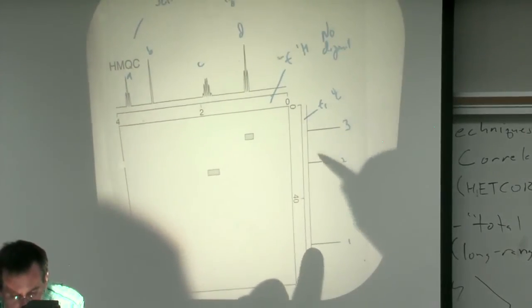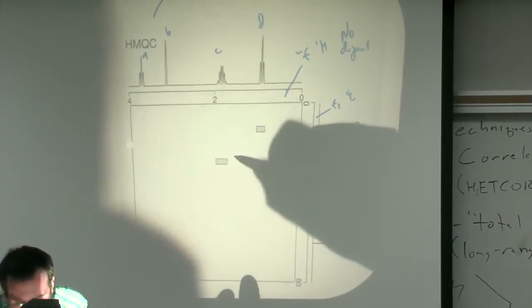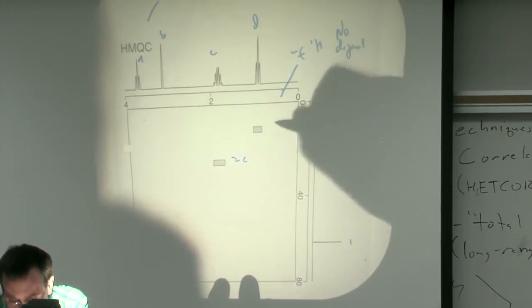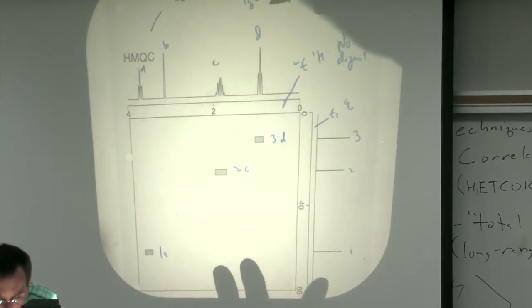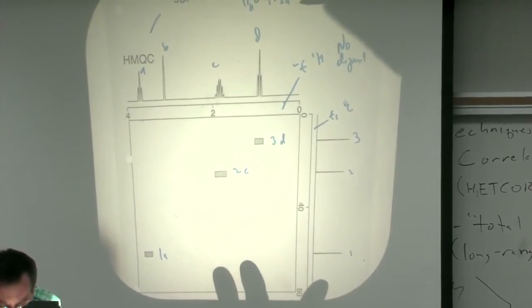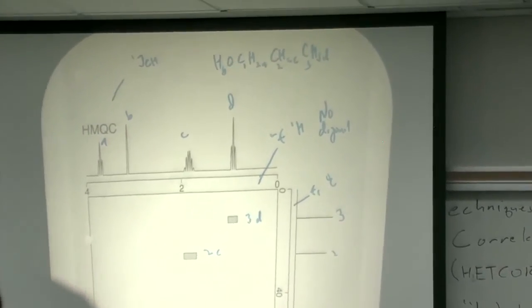1A, so in other words, I look across 1A, I look across 2C here, and I look across 3D, and nothing's crossed with B. And so I can say, okay, this is C1, this is C2, this is C3.